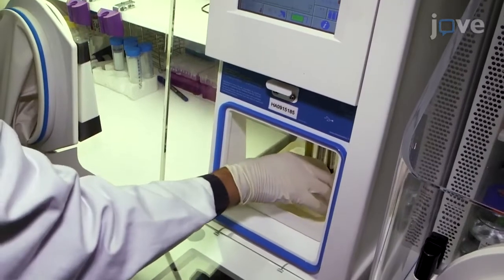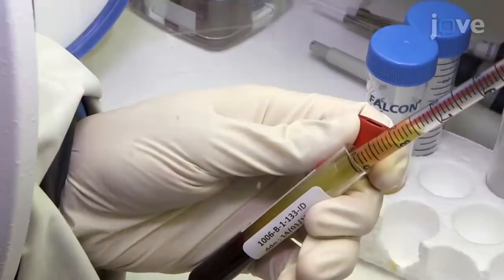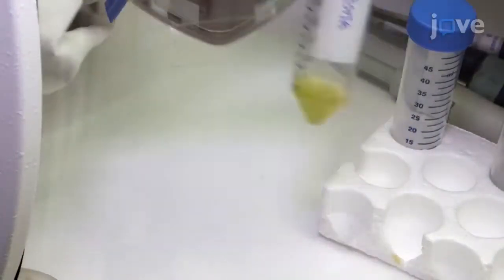Without disturbing the separated blood, transfer the tubes to the anoxic cabinet and transfer the plasma fractions to a 50 mL conical tube.